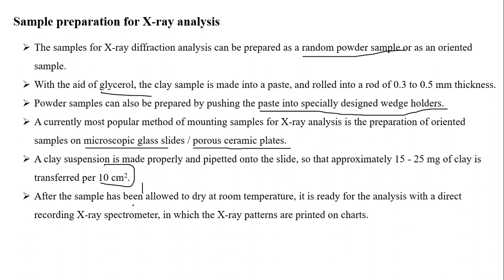Then it is ready for analysis with a direct recording X-ray spectrometer that prints X-ray pattern charts. So after treating the sample with glycerol and doing all this, we allow it to dry over the 10 square centimeter area and put it under the X-ray spectrometer. It takes a long time, students, not unlike differential thermal analysis. Here in X-ray diffraction it takes a long time to get a printed chart. Nowadays everything is computerized.